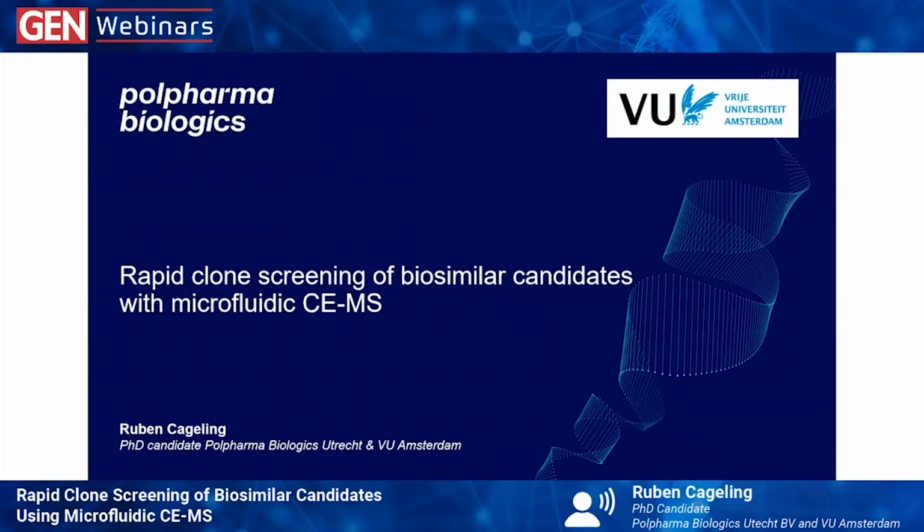So hello everyone. My name is Ruben. I'm a PhD candidate at Polpharma Biologics in Utrecht and for the VU University in Amsterdam. And today I'm going to talk about rapid clone screening of biosimilar candidates with microfluidic CE-MS or the ZipChip.